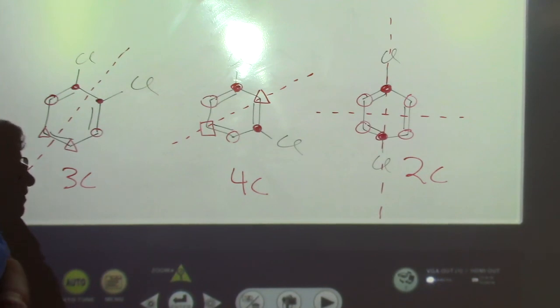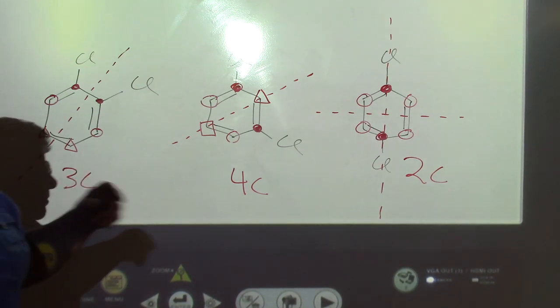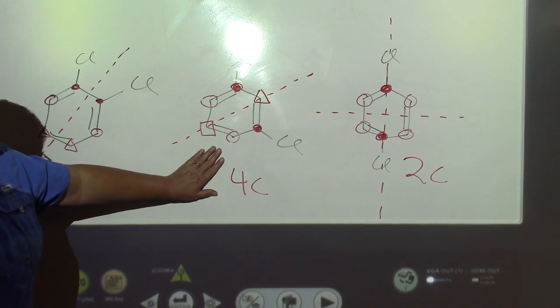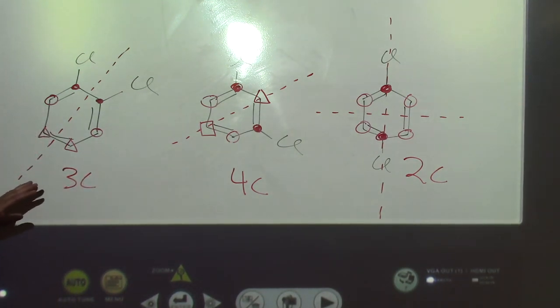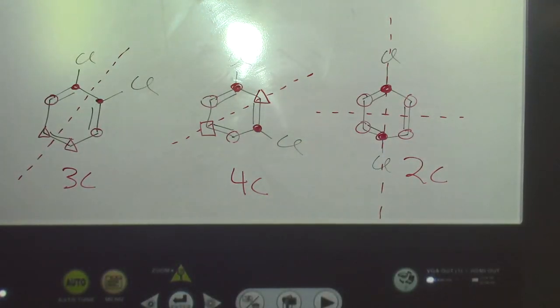And so now I can very easily say that the spectrum on the top of your sheet with 2 peaks is this compound, the middle compound with 4 peaks is B, and let me make sure I'm reciting these for you correctly. Oh, I'm sorry, yeah.